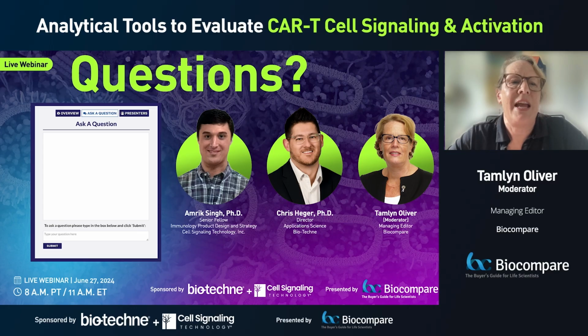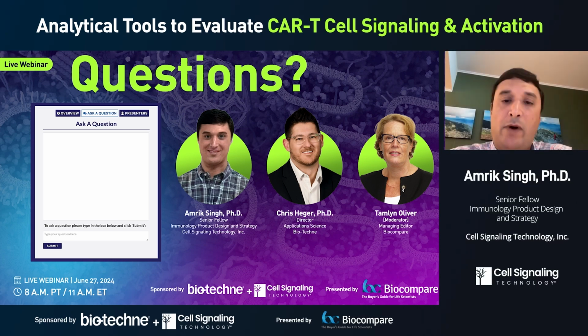In a flow cytometry assay, how does the sensitivity of CAR linker mAbs compare to other CAR detection methods such as protein L and recombinant CAR target antigen? This is a great question because detection reagents such as protein L and fluorochrome conjugated CAR target antigens were tools that were previously commercially available prior to our commercialization of the linker antibodies.